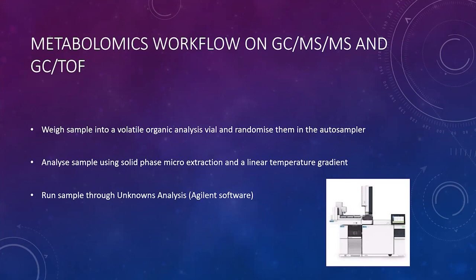So we analyze these samples using solid phase microextraction, which is just a little bitty fiber that is pushed down into the sample while it's being heated up in a small oven.